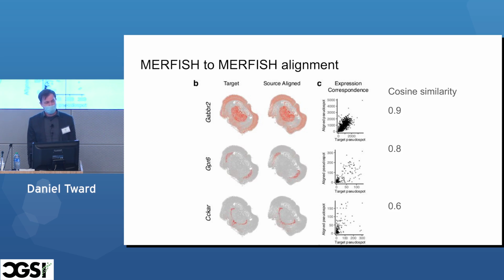So these replicates are different mice brains sliced at approximately the same location, imaged using a particular MERFISH pipeline, and we're just trying to compare before and after, one replicate versus the other replicate. Are the gene expression profiles we measure the same? Yeah?